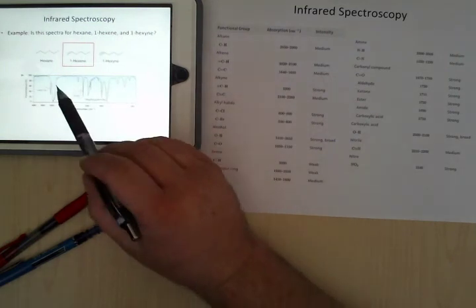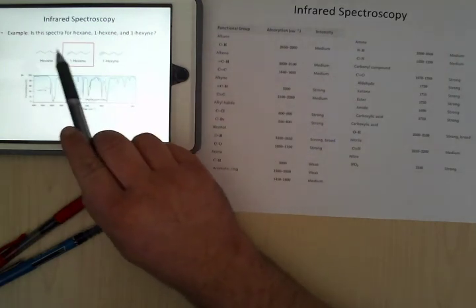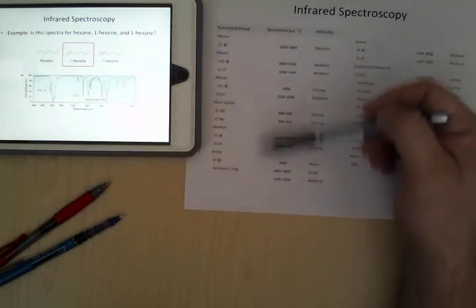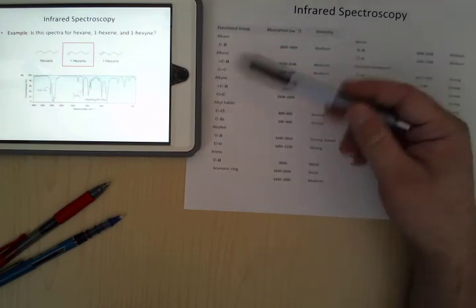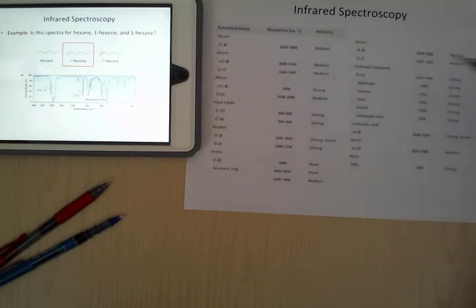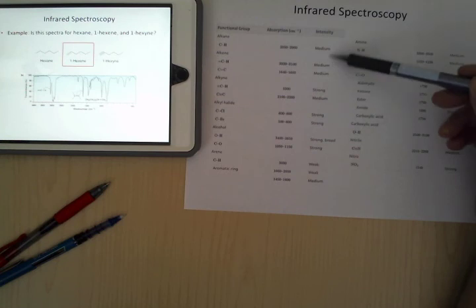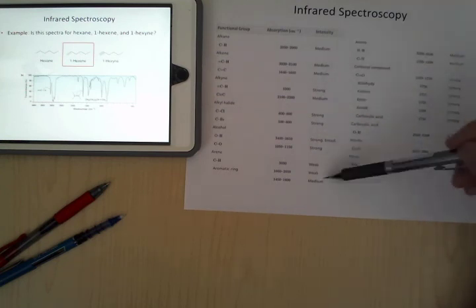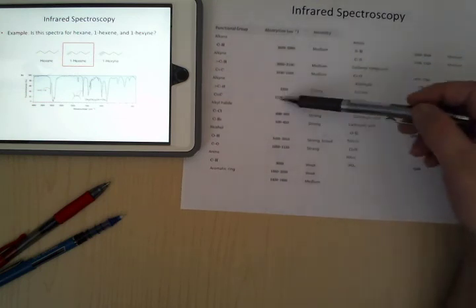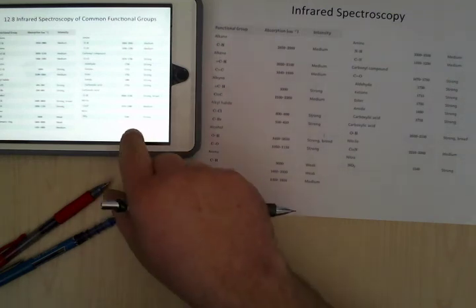And so what's happening is we have this peak and this peak here, and you can look at what the differences are between these. They're going to have slightly different fingerprints because they have slightly different stretches. I also should point out, I don't really care about the intensity. I'm looking at functional group and the absorption, because intensity can be dependent on the molecule. So I wouldn't get too worked up over the intensity. It's really this and this that you need to know how to use.